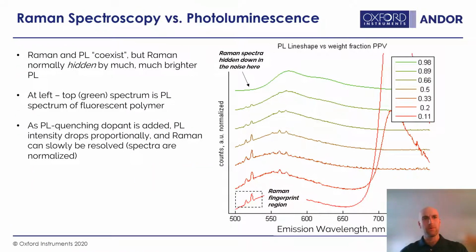So to compare Raman spectroscopy versus photoluminescence, I just wanted to show these two. This is a measurement that I made back in grad school. I'd hesitate to even call it an experiment, but there are 2 components here.